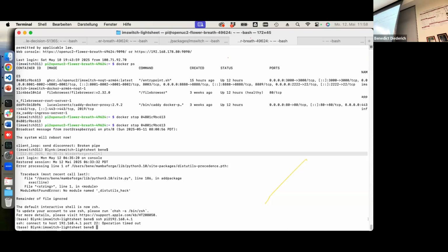And so really that does, part of, but yeah, you have to have some ways of increasing what it is. Yeah, really. If I were to, how do you, with the light, get to the ice? This rotation is not there. So it's not the X, Y, Z. So you do the rotation level, I think, in the water.